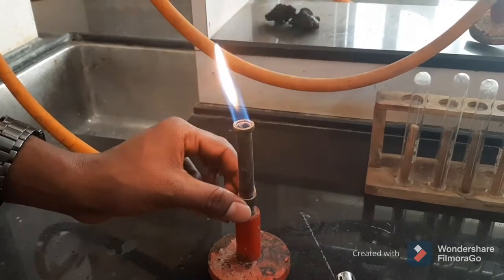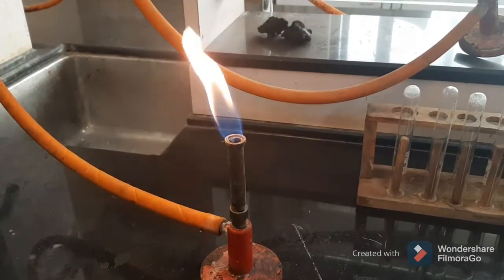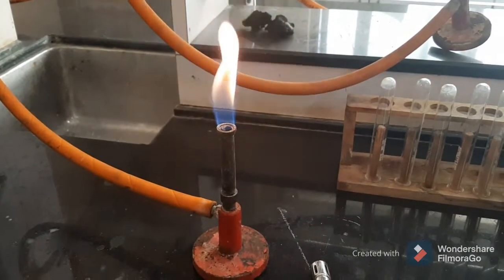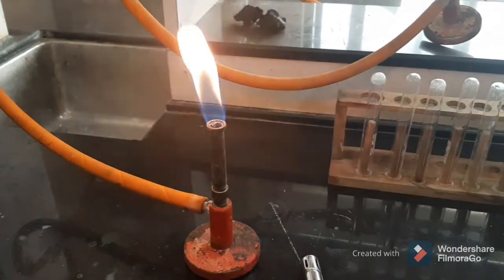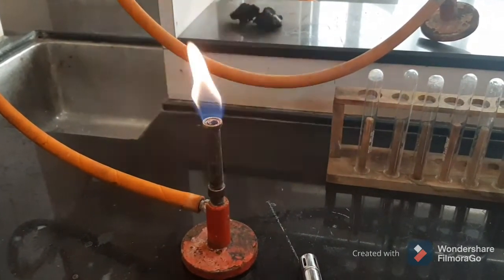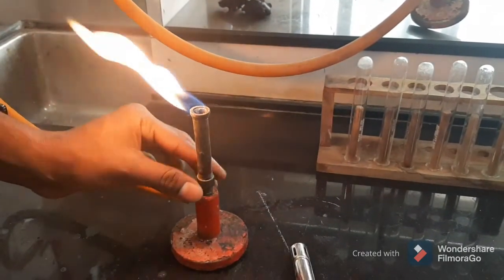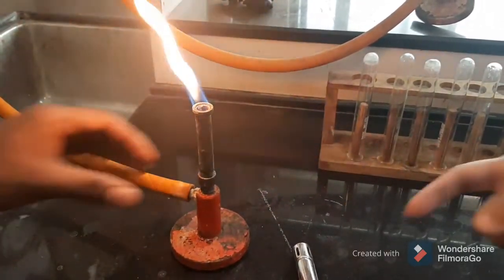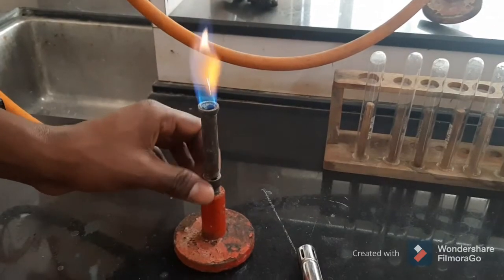We get a sooty flame which is yellow in color — this is the luminous flame. It acts as a reducing agent and this flame is used for a charcoal test. This flame does not provide much heat.